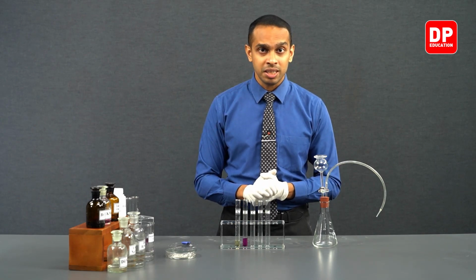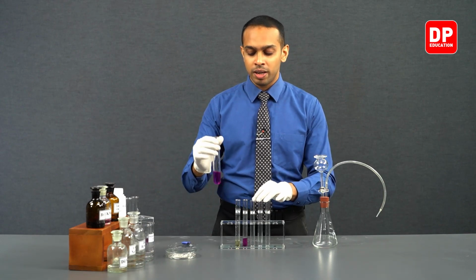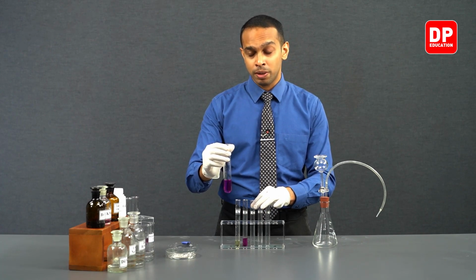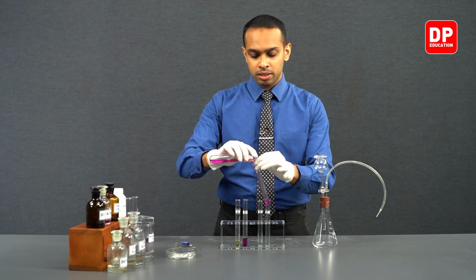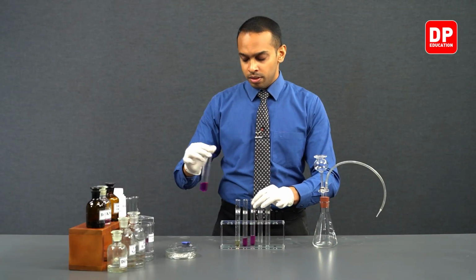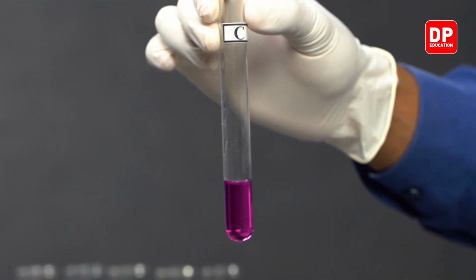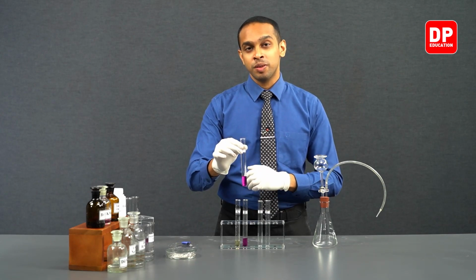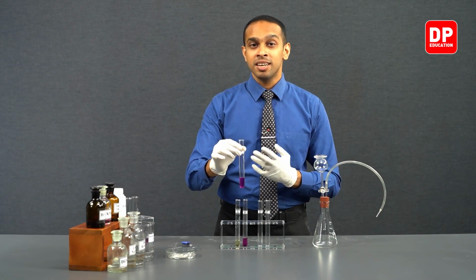And to test tube C, we are going to be taking acidified potassium permanganate. So we have a sample of acidified potassium permanganate that we prepared in the previous part of this experiment. We are going to be adding a small amount of acidified potassium permanganate into this test tube. And as you can see, acidified potassium permanganate is also purple in color. As ethyne gas reacts with acidified potassium permanganate, you have to observe whether there is a color change.